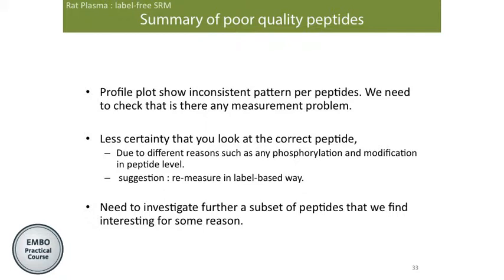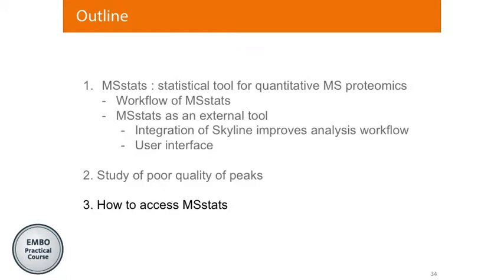This part you need to be aware of, and then you need to dig a little bit into these issues. So please check your poor quality data. I know there are some advanced peak picking programs in Skyline. If the measurement itself has, like, a different peak or something, this advanced peak picking program is actually correcting the measurement itself. So you need to check this one also.